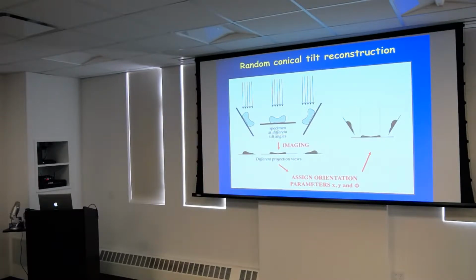And then you simply shine light through these projections, and where they intersect, they're going to carve out a three-dimensional reconstruction of your object. And so this is a very, very nice way to do this, because the geometry is totally defined. There's no guesswork in there. The problem with this approach is that you need a specimen that is in a preferred orientation, or just a few preferred orientations, which meant that usually you did it with negative staining.